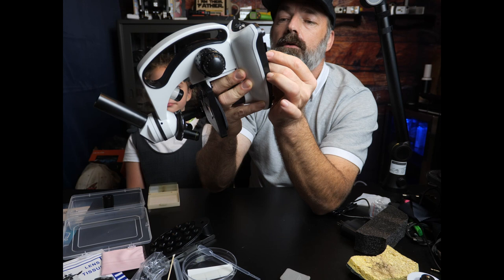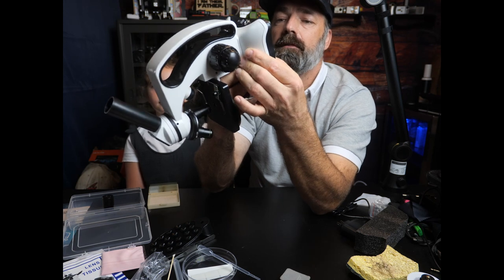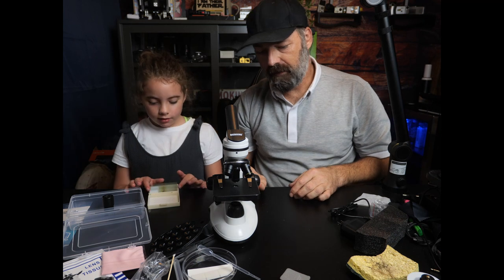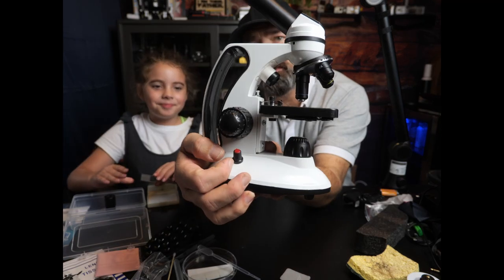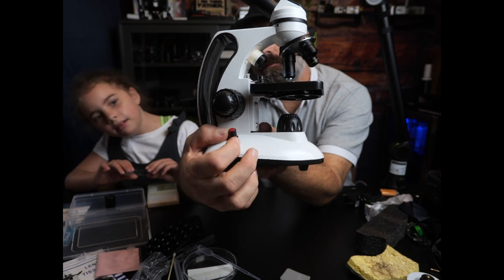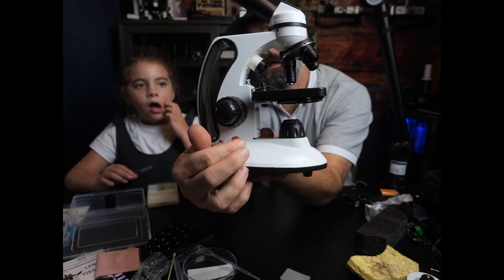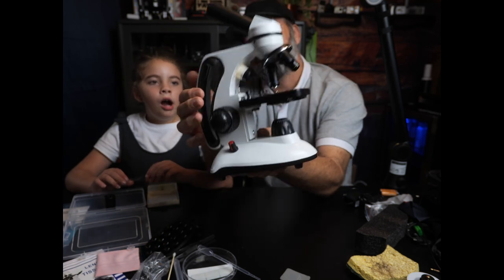On the bottom, if you don't want to plug it in, you can put three AA batteries in. If you don't want a cord, just stick some batteries in the bottom. On the side there's a dimmer switch so you can brighten or lower your lights.